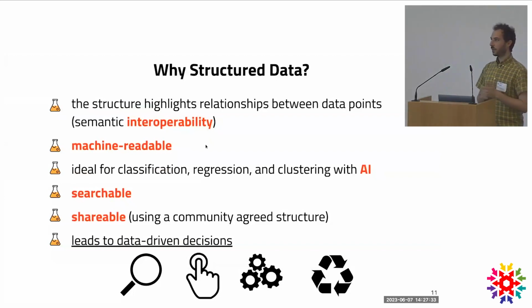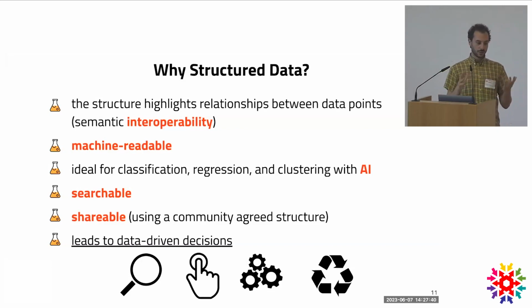So whenever the structure is written in a standard way, then it becomes also machine readable, and this is necessary for the next step of the use of our data, that is the final sophisticated kind of analysis, such as the artificial intelligence based ones. And we also get a lot of advantages in structuring data that are just connected also with the data management within our lab and during the production of the data, and especially in the long run.